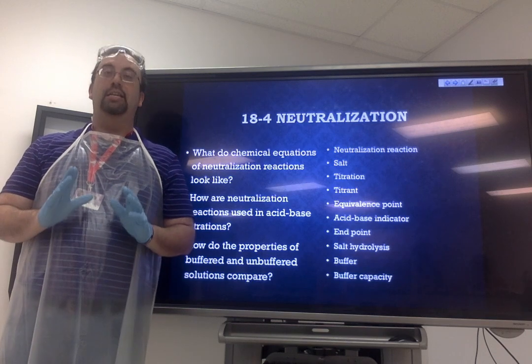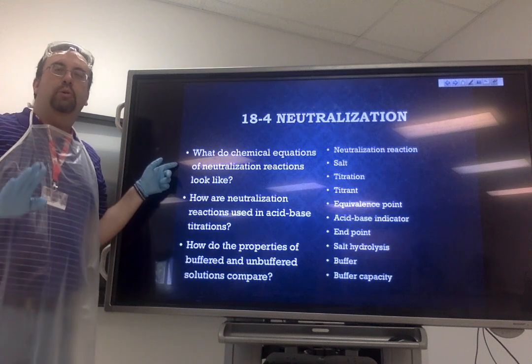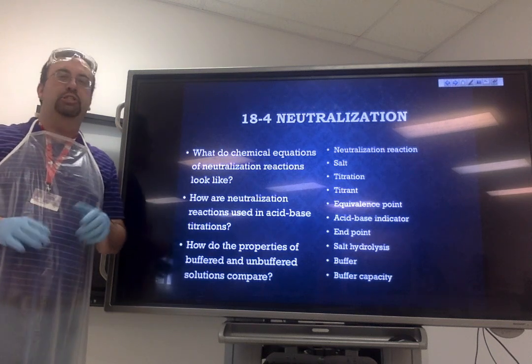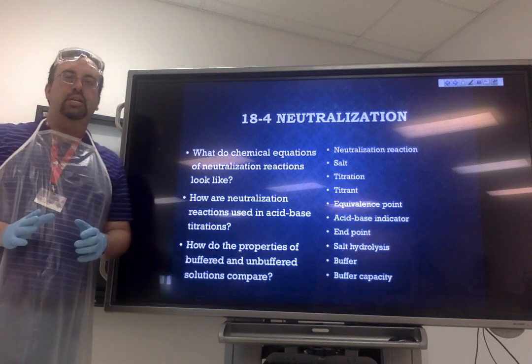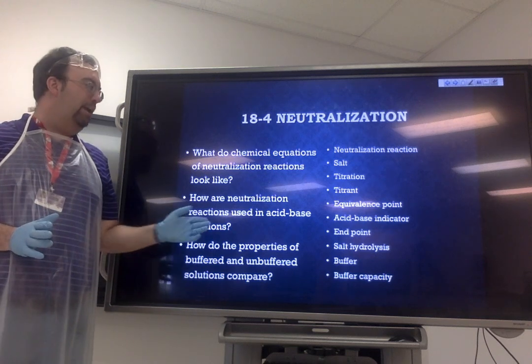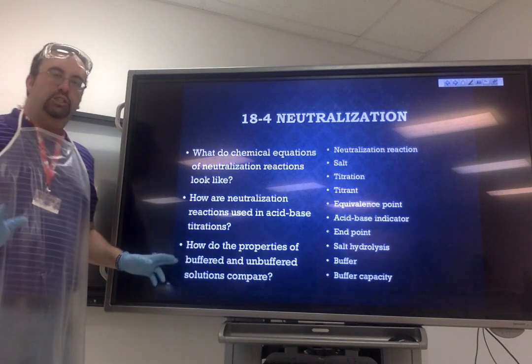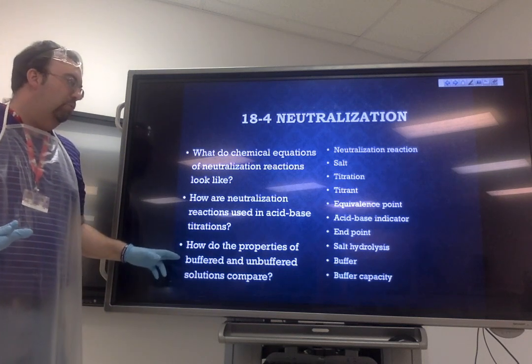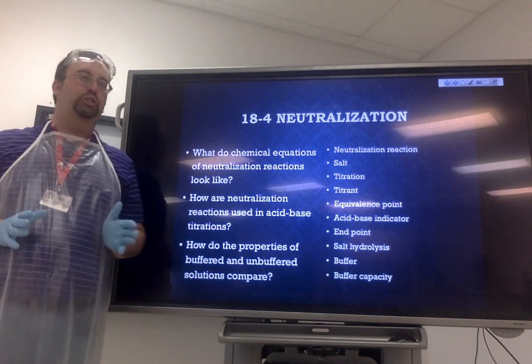And so today we'll be looking at a few things. First of all, we're going to see what chemical reactions of neutralization reactions look like. We'll also see how neutralization reactions are used in acid-base reactions and titrations. Also then, we'll see how properties of buffered versus unbuffered solutions compare.